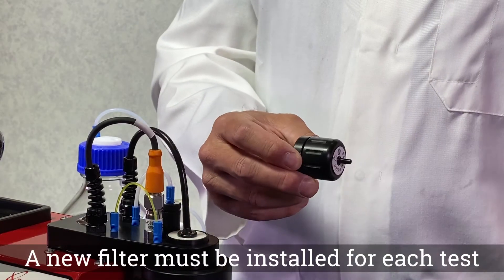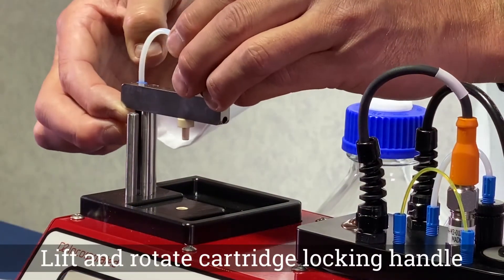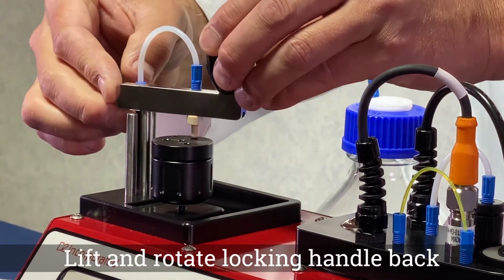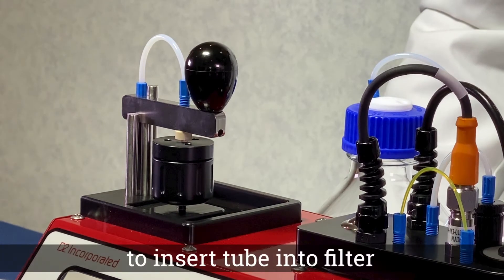A new filter must be installed for each test. Lift and rotate the cartridge locking handle. Insert the new filter into the filter port. Then lift and rotate the cartridge locking handle back, inserting the tube into the filter.